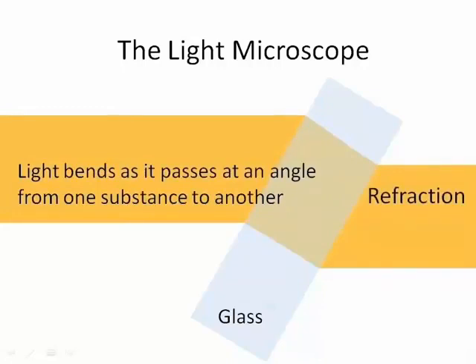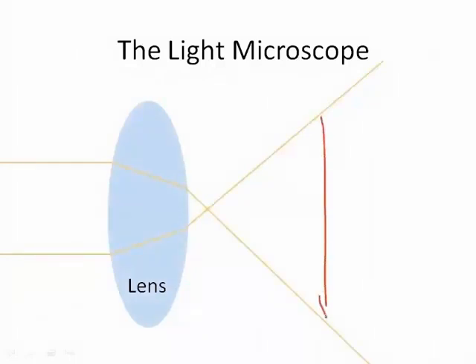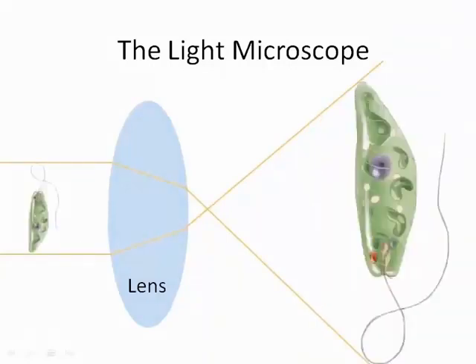In a microscope, the surface of a lens is at an angle to the path of the light, so the light refracts. The result of refraction is that the light rays from the two sides of an object end up further apart than they were originally. We perceive the new positions of the light rays as magnification. Notice that because the light rays cross one another, a microscopic image is not only magnified, it is also upside down and backwards.